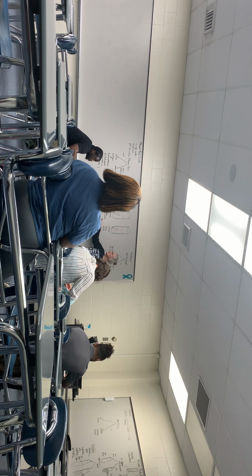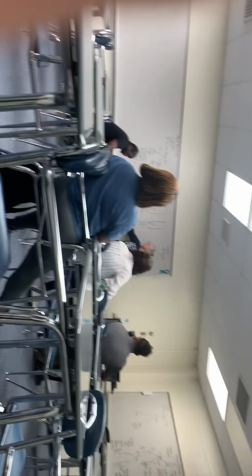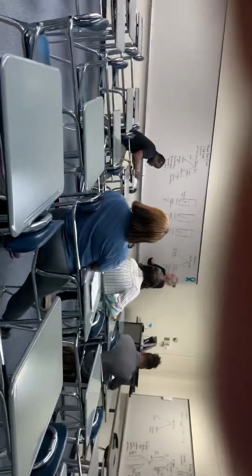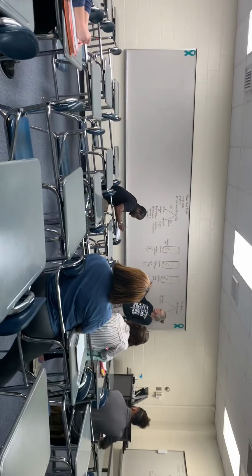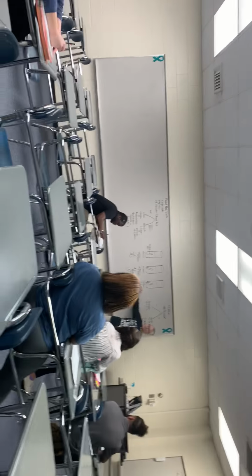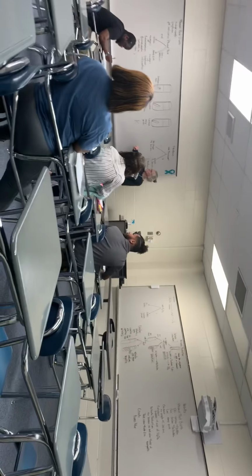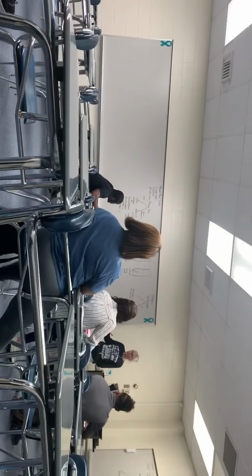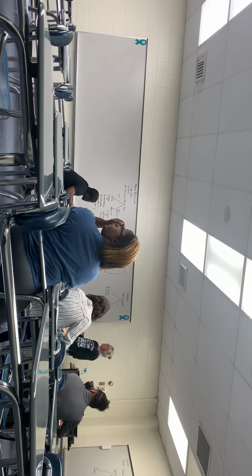You can get acid with no bubble. Usually we record that as A over Ng, or either just A over a little negative, meaning that there was no gas present. And then if it's deep pink, in this case, this would mean it's not using the lactose. It's using the peptone. And usually we represent that as a capital K for alkaline. So that's how you would read that.